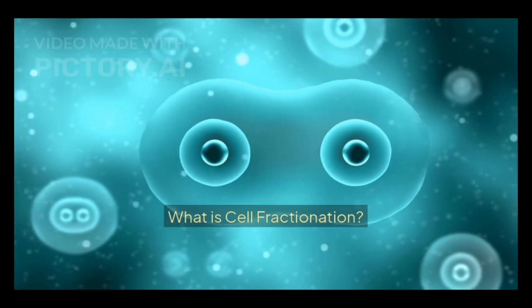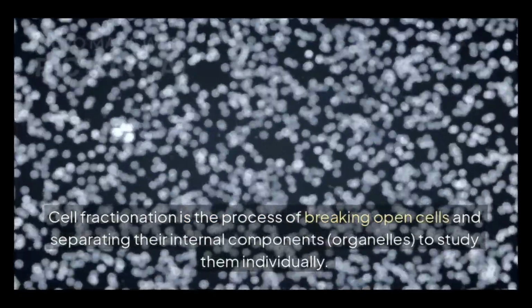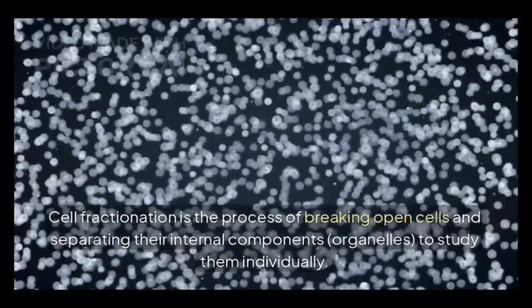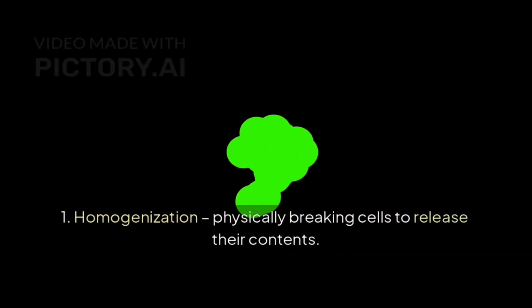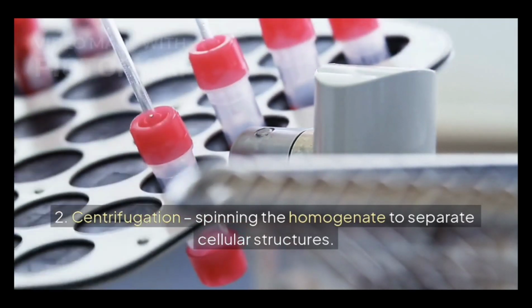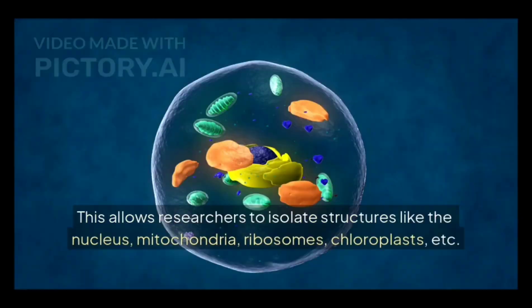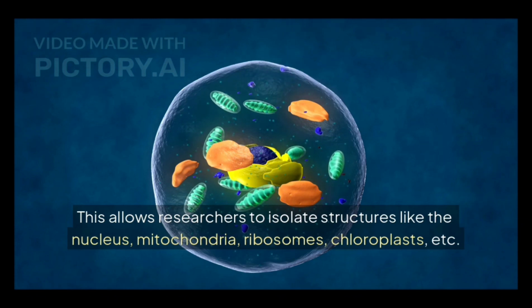Now, let's understand what is cell fractionation. Cell fractionation is the process of breaking open cells and separating their internal components, organelles, to study them individually. Cell fractionation typically involves homogenization, physically breaking cells to release their contents. Centrifugation, spinning the homogenate to separate cellular structures. This allows researchers to isolate structures like nucleus, mitochondria, ribosomes, chloroplasts, and etc.